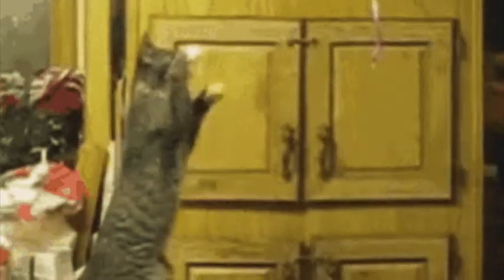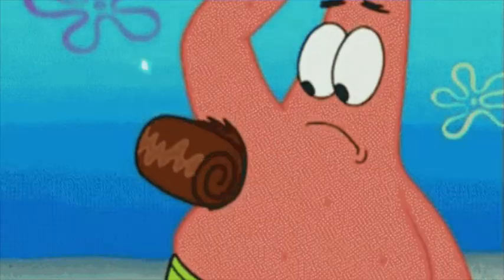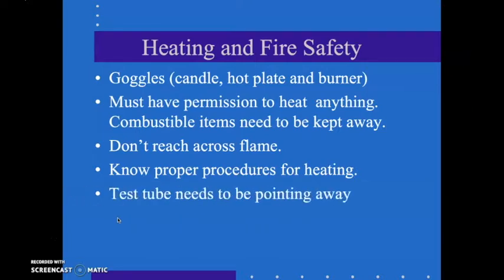Don't reach across the table, especially if you have a flame that you're using, unless you don't want your armpit hairs. And I know that everybody wants their armpit hairs. That'd be kind of crazy. Use proper procedures for heating. There should be a step-by-step procedure on how you heat things, and your instructor should be able to show you how to do that.